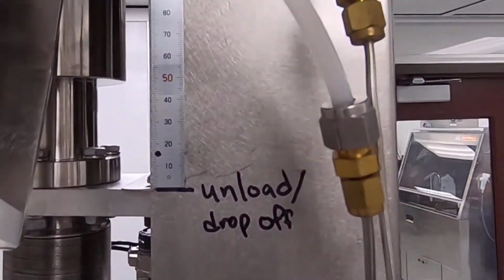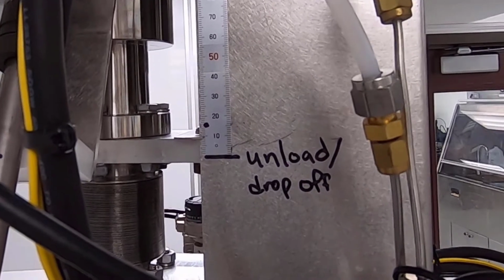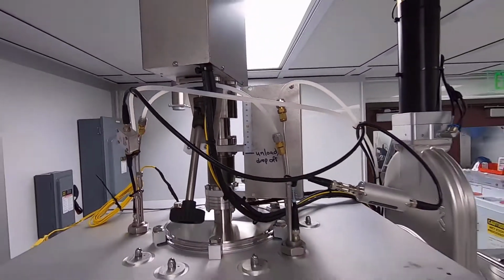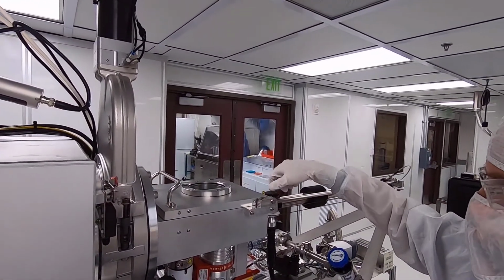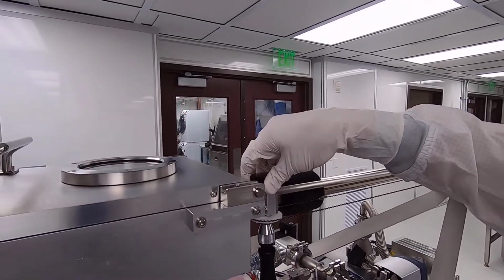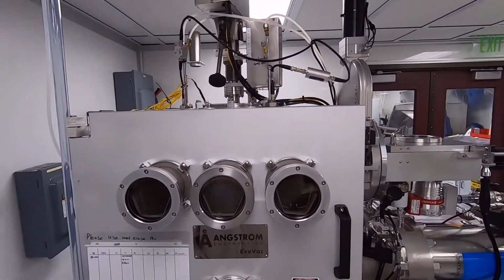Tower to a safe position for me to drive all the way in with my paddle. So that black dot right there, that's sort of a safe fly height. Now I'm going to drive my sample all the way in again to my physical stop. There we go. And now we're going to basically lower the stage inside here.